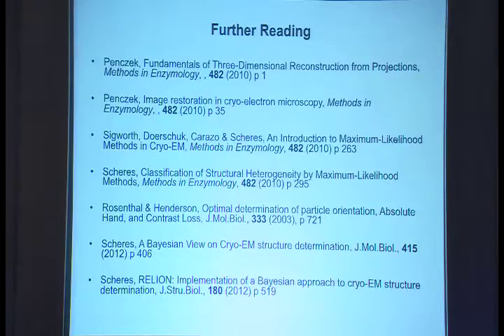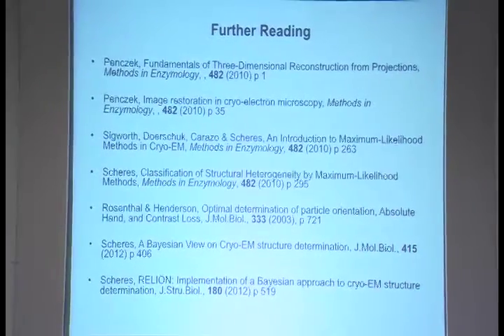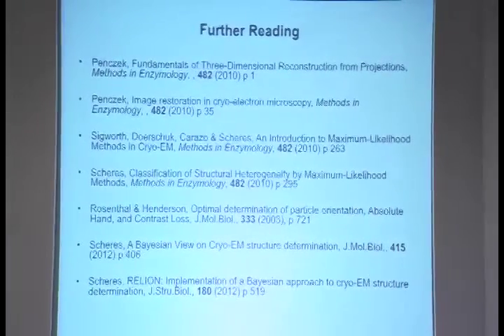So I have one question: when you generated reconstruction from your noise images, did you use any initial model, or the same initial model as for the virus? Yeah. So the way I did this was for a different purpose. We were trying to estimate what is the real resolution in the map, so how much noise is being built by different programs. So the way we did it was to pick the noise, those are the empty regions, and then use the orientation parameters from the real particles, and then do a reconstruction. And that way, this already tells that some of the programs you can't just refine noise.